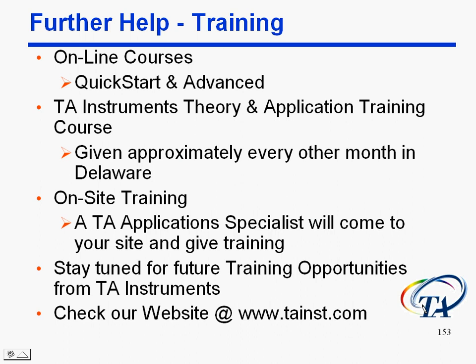the TGA course. Now when you buy an instrument from us, you get tuition for one person to this course at no charge. But if you haven't bought an instrument from us recently, or if you have more than one person that wants to attend that, these courses are available for $400 per person per day.